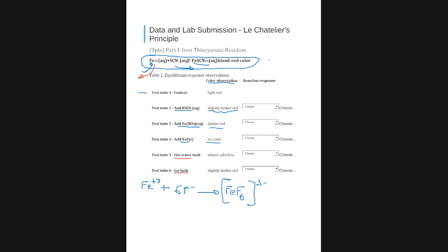Basically, Kevin, what you are doing is looking at the color. I think it's so simple that you probably think it should be more difficult. If you disturb the system and the system becomes intense red, darker red, you will say the system shifts to the product because the product has that color. But if you disturb the system and the system has no color, you know that the reactants have no color. So you will say the system shifts towards the reactant side. Basically, that's all it is.